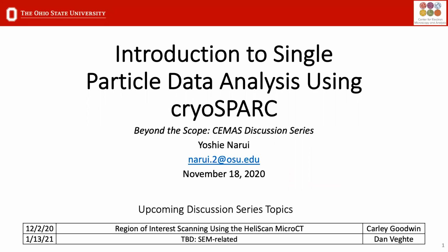But you do need to know certain conditions of how the data was collected: the accelerating voltage, spherical aberration, pixel size, and dose. That information should be provided to you either by the center that collected the data, or you should have recorded this yourself. Okay, so now I'm going to walk you through the pre-processing steps.